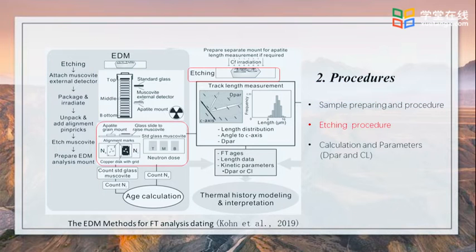Briefly, the spontaneous fission tracks are etched on an exposed internal polished surface on the grains, and the induced tracks on a Muscovite external detector attached to the grain surface during neutron irradiation. The external detector is usually a sheet of low uranium Muscovite, commonly Brazil ruby, which is clear and free of inclusions, cracks, waves, and other defects, with about 5 ppb uranium.